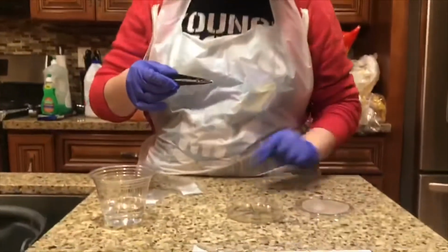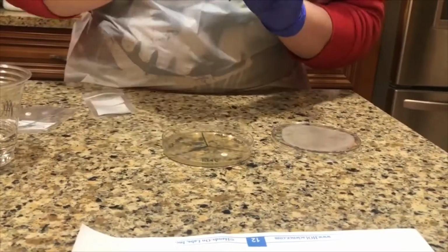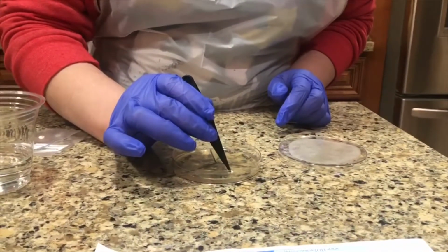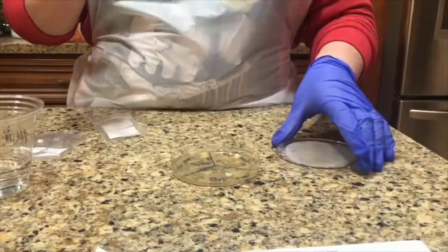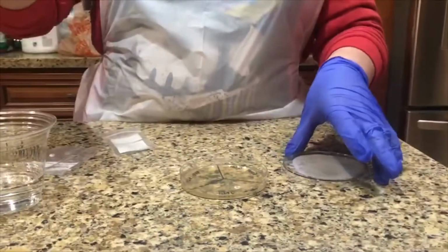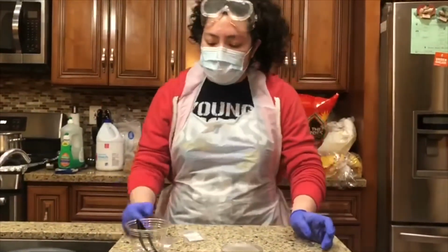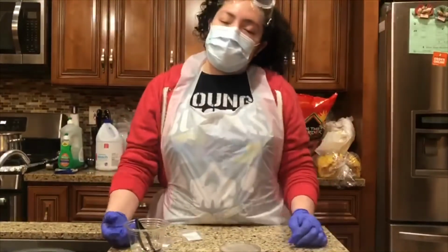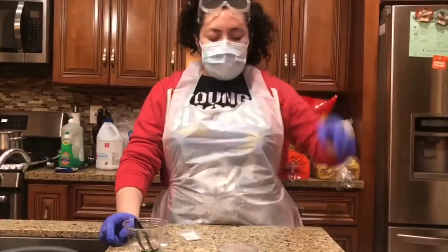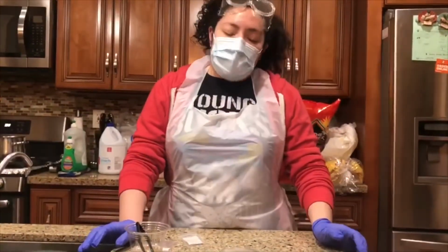Open my agar plate, and with the penicillin right there, I'm gonna put this right on top. And then kind of squeeze down a little bit so I can get a hold of it. All right, put this in the alcohol, cover this back up, and then I'm gonna wait for 30 seconds. Do the second antibiotic and place it in the alcohol for another 30 seconds and do the last antibiotic. And then I'm gonna wait 12 hours to see any bacterial growth, basically see my results. If I don't, we'll leave it for an additional 12 hours and see my results.